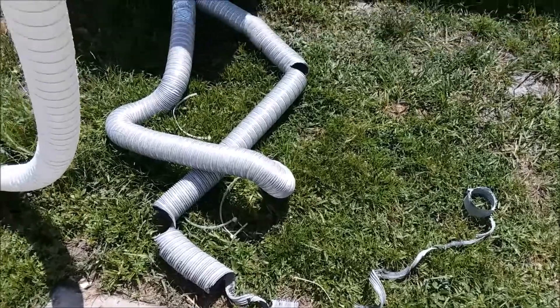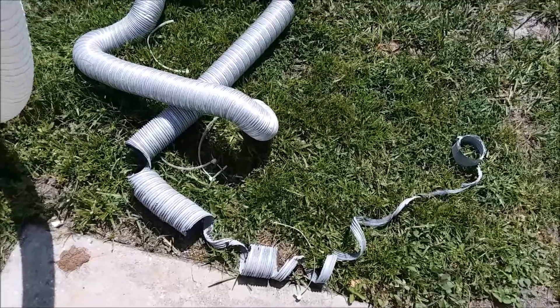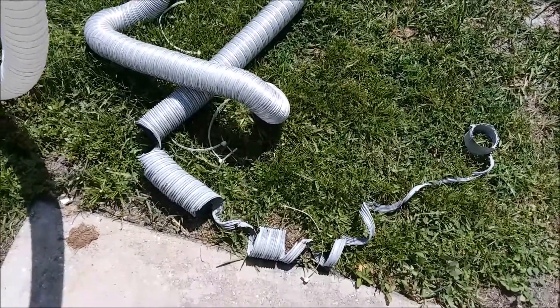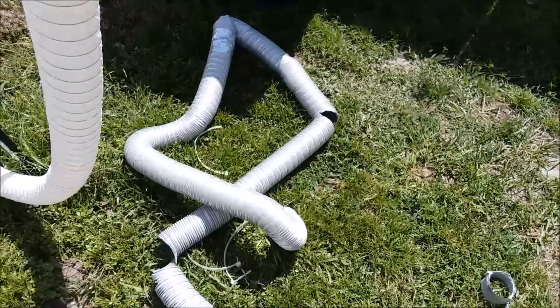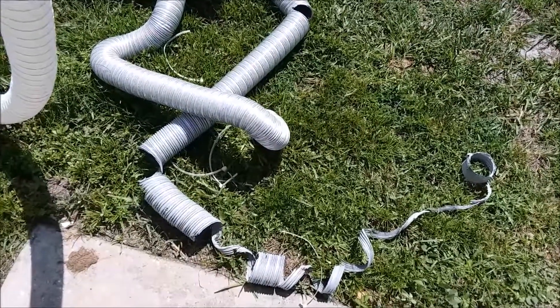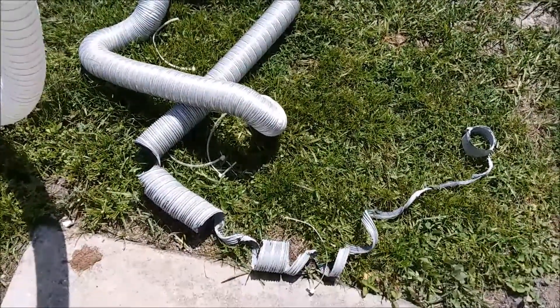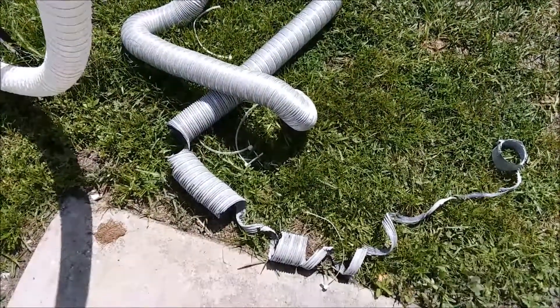Those of you who told me the aluminum duct wasn't going to work — you were right. I knew it wasn't going to work for long, but it was the only duct I could find locally. I looked everywhere and called around; people only had aluminum duct. So I had to order some online. I was hoping it would last a month or two, but it rotted out in a little over a week. I was going to patch it, but every time I touched it, it just fell apart worse. Fortunately, the new ductwork has arrived.